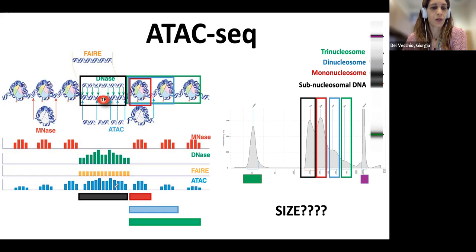So what we'll obtain is peaks like the one you can see here on the bottom. We will have multiple peaks where we don't have any histone, and then peaks only close to the histones. So just these more available regions here and here and same here.